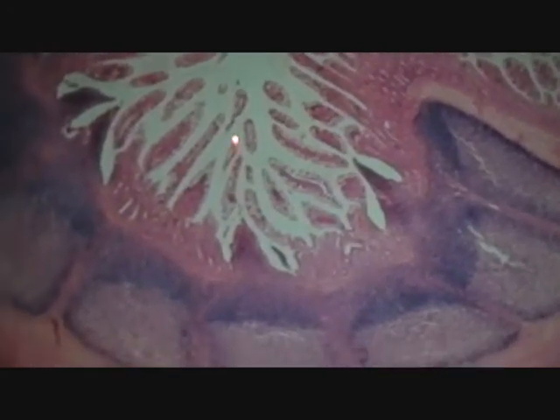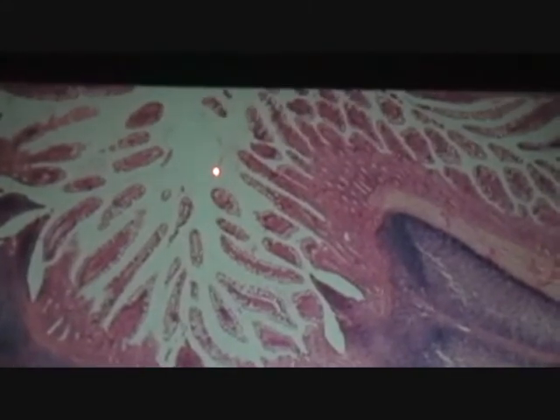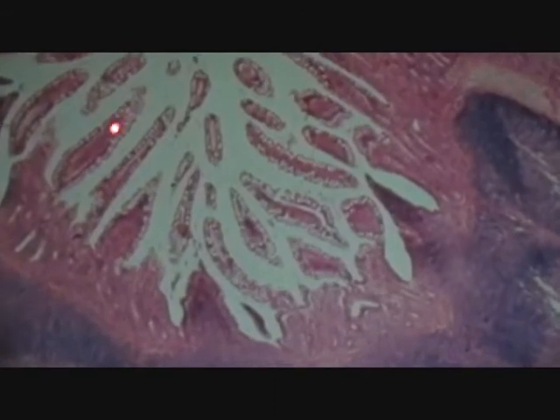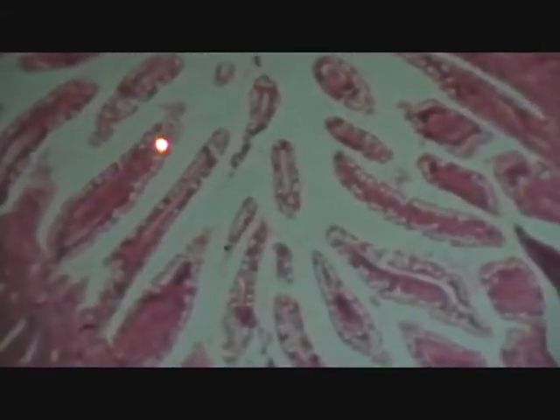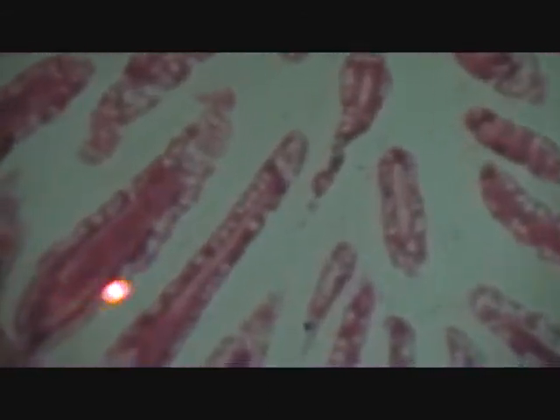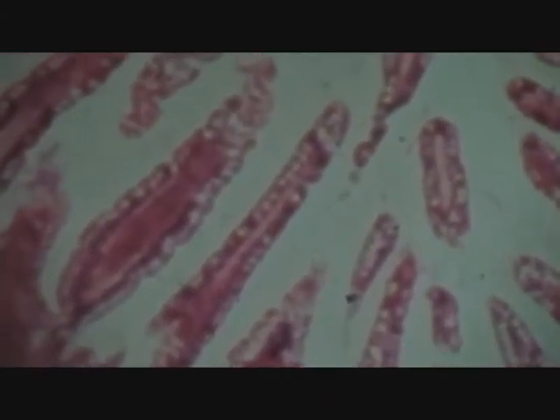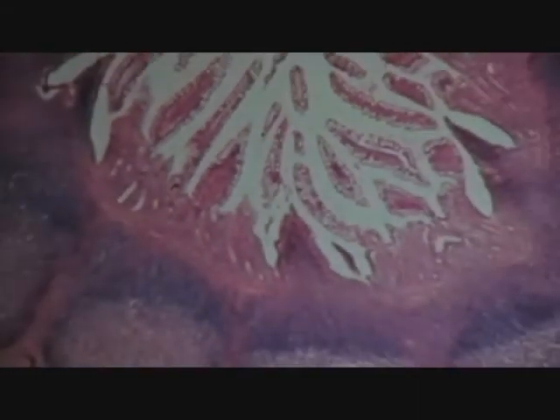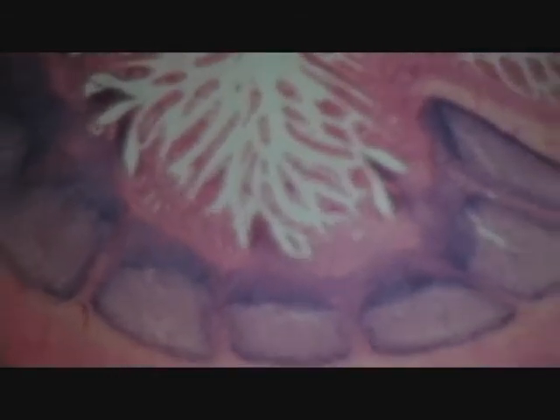And then, I would never ask you this, but you could see the bubbles? Little small. That's another sign it's got to be ileum, to see that number of goblet cells all over the villi. But I would never ask you about that for ileal identification. It all revolves around this. You get advanced histo and you start looking at goblet cell concentration and silhouettes.